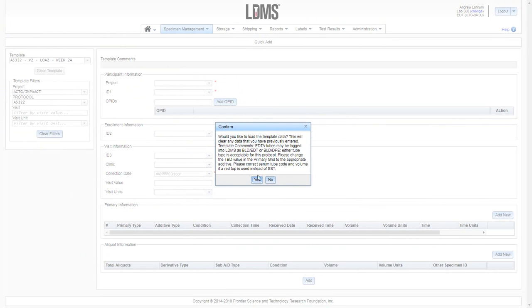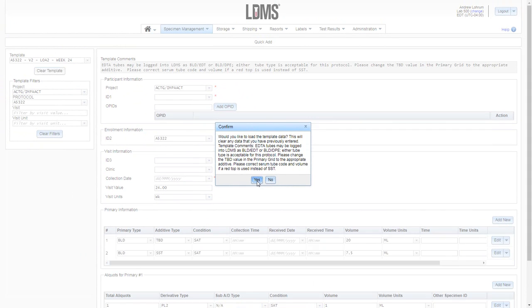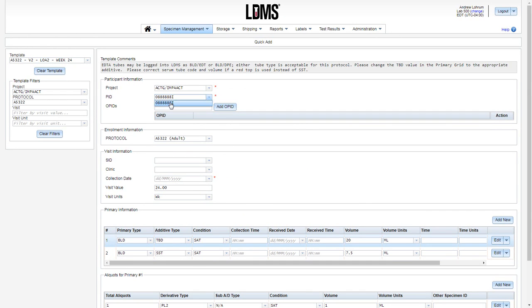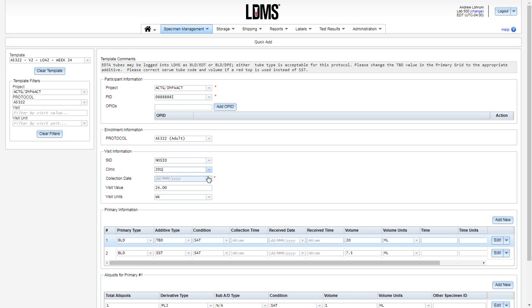Once you click yes, those template comments will then load into the gray box above, so you can continue to review if you need to. Next, you will continue to fill out the Quick Add form, starting with our PID, Study Identifier, Clinic, and Collection Date.